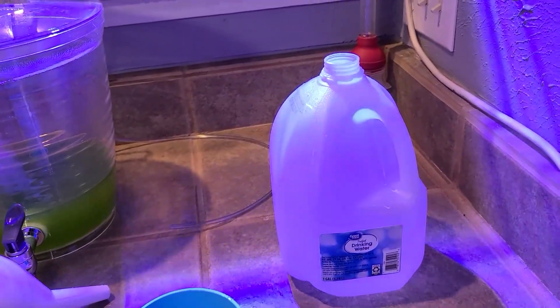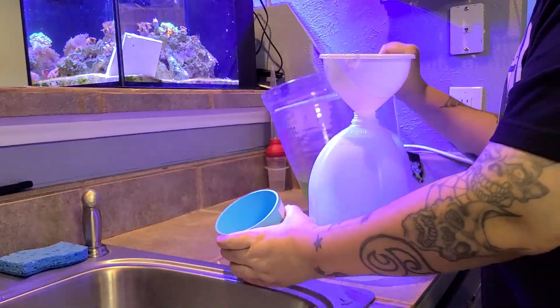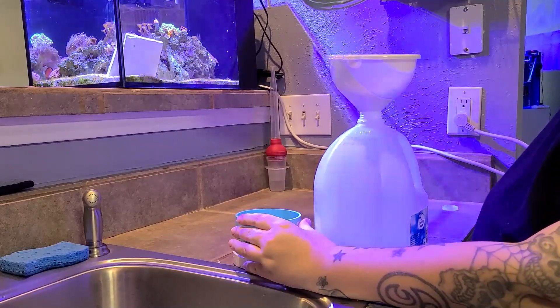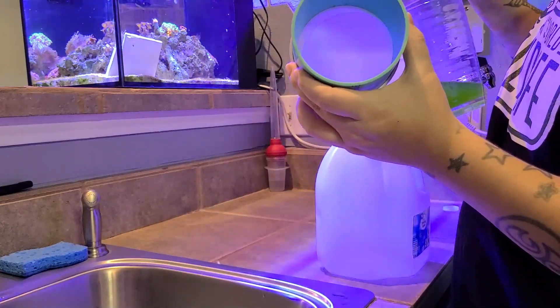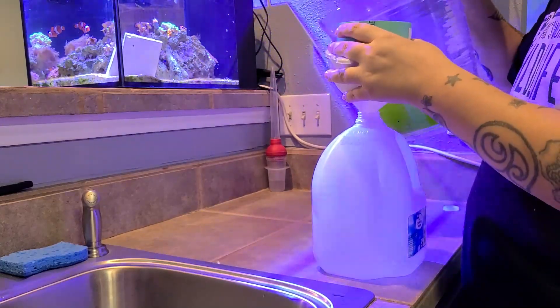You'll need a container, and the reason I'm using this sieve is because there's going to be a lot of gunk on the bottom — some phytoplankton sediment. Once we drain it into the screen I'll show you what it looks like, and I don't want that going back into my culture. I want it to be as fresh as possible.